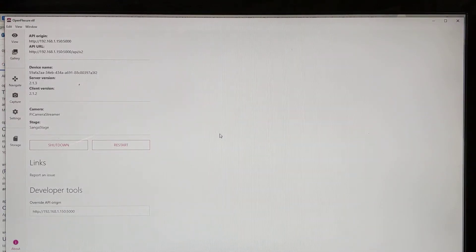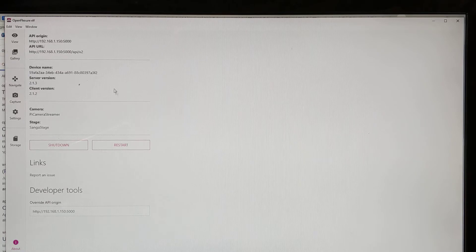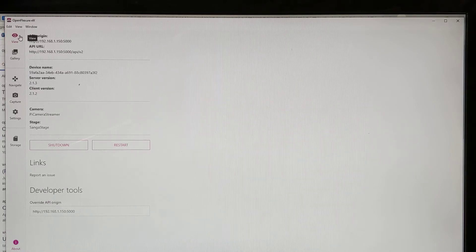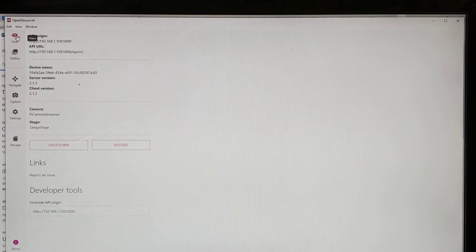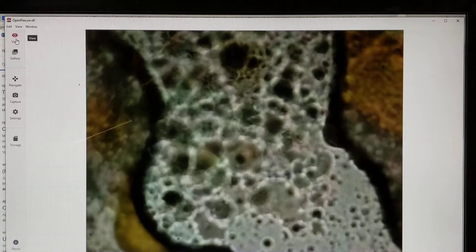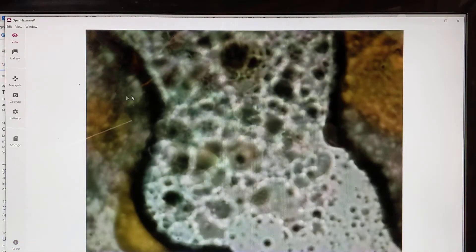I started up the OpenFlexure software and connected to my microscope. I've loaded up a slide with a little bit of my dinner left over on it, just so you can see what it looks like. So we can flip over to view, and this is the first image that I get.